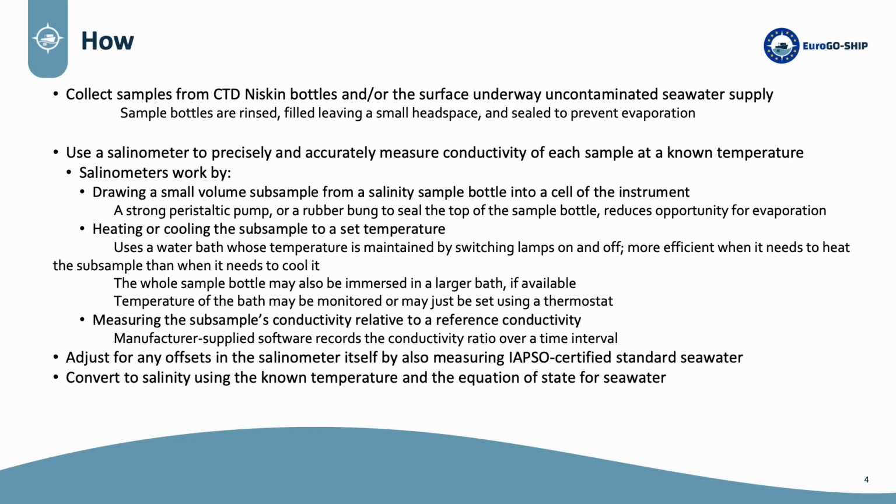You then adjust for any offsets in the salinometer itself by also measuring IAPSO-certified standard seawater as a reference material. And finally convert this conductivity to salinity using the known temperature and the equation of state for seawater.